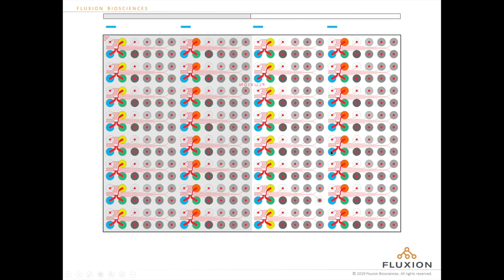Then what we did is that we added ICS1, which is, I believe, the one which actually reverses at around -60 in here. And then ICS2 we added in here, which means that each experimental pattern will get to see ICS1 and ICS2 with the same cells at the same time. And then, of course, we added the 2 different extracellular solutions, one here and one here.